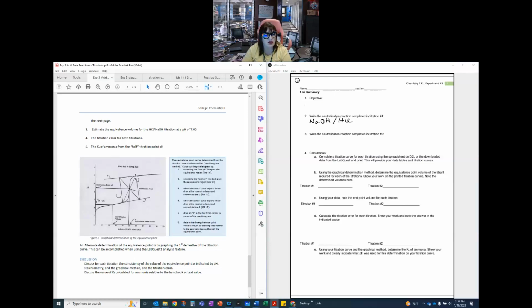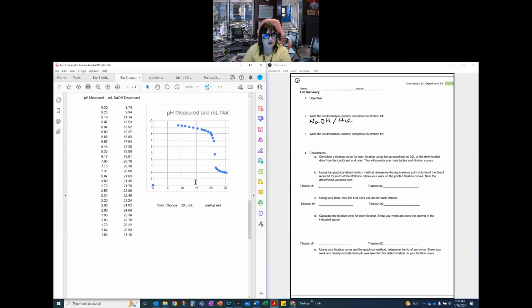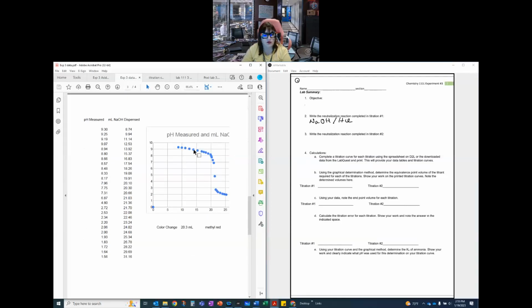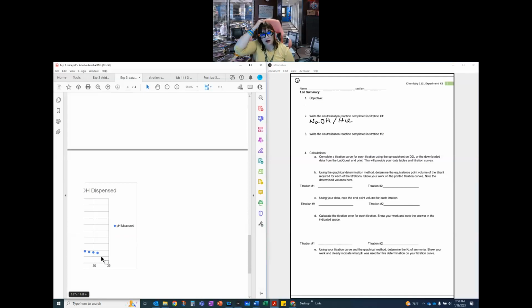We don't necessarily have that much up on this side, but we will be okay. And you can do it for both experiments, this one and the one below. Okay, so again, you're going to draw one sort of here-ish and then down here-ish. And of course, we hope that this is going to be all on one piece of paper so that you can do that. So when you save it as a PDF, try and get those images on one graph so that you can make that work. Okay, so that's how we're going to do that part of it.